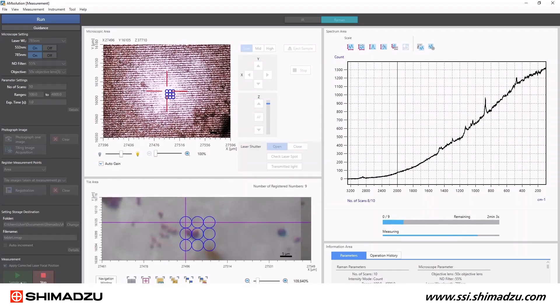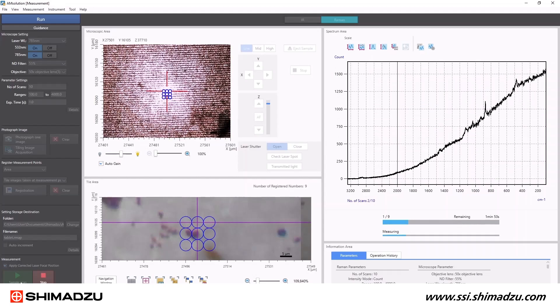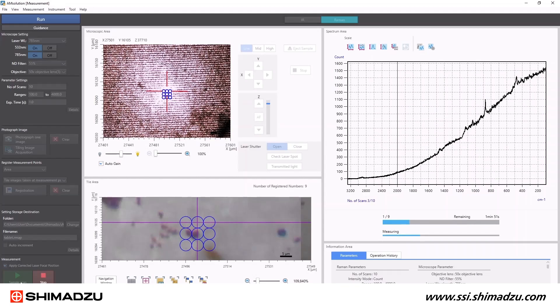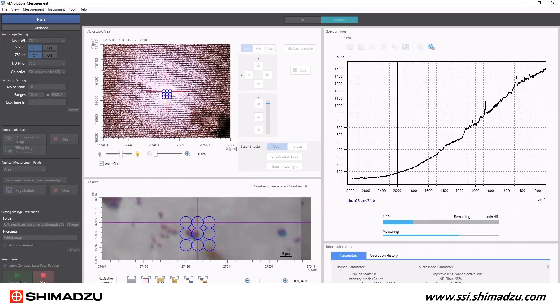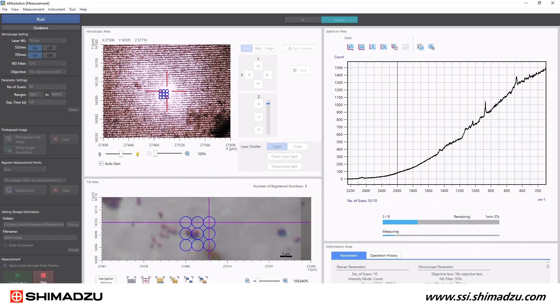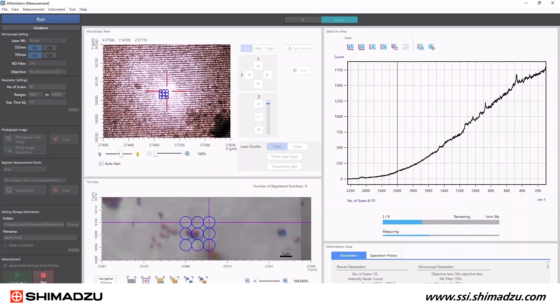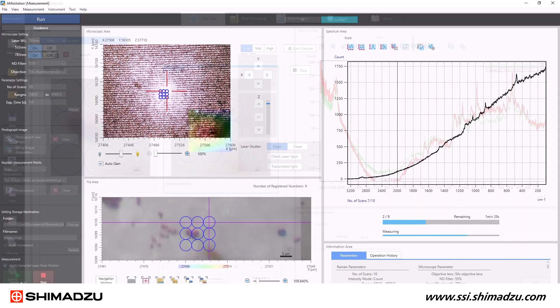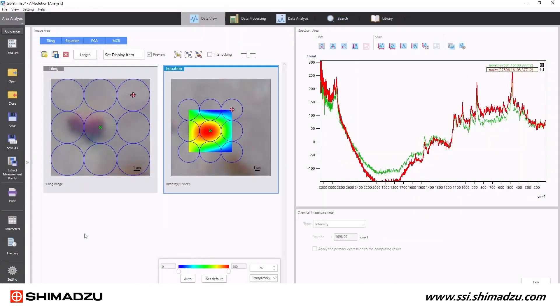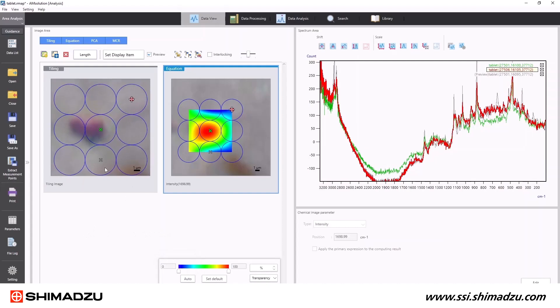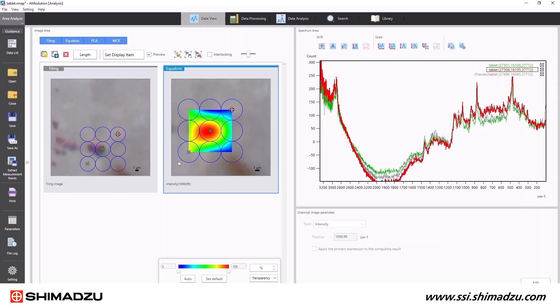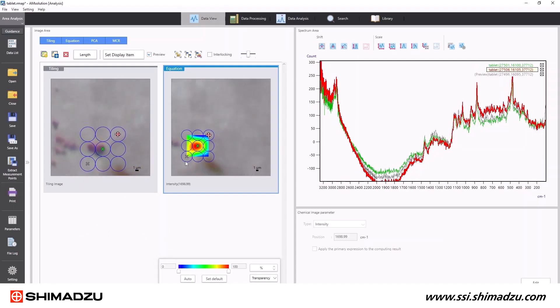An impressive function of the software is the mapping measurement settings. A sample can be continuously scanned in a line and over an area to map changes or variations in chemical composition across the sample. Additionally, Raman depth mapping measurements can differentiate chemical species through various layers.